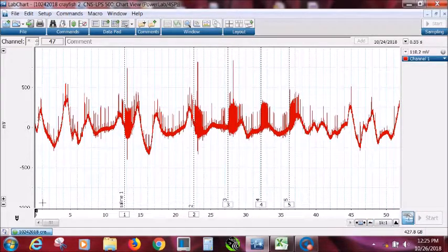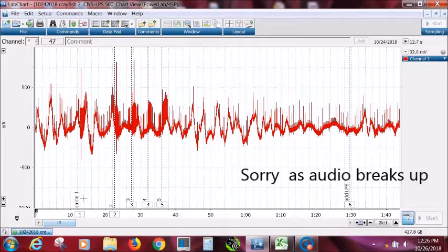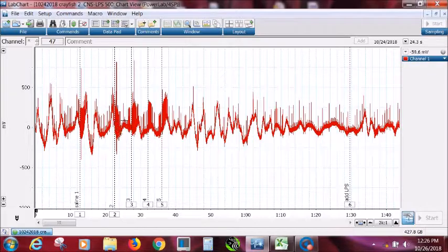Let's look over our protocol real fast with a condensed version of the file. What we did is record from this third root with the suction electrode, and then brushed on it 5 or so times during saline. So here's brush 1, it's called saline 1. In the saline we brushed on it, and you can see the activity. Then we did it again, and again, and again, and again, with a little break in between. So here are 5 brushes.